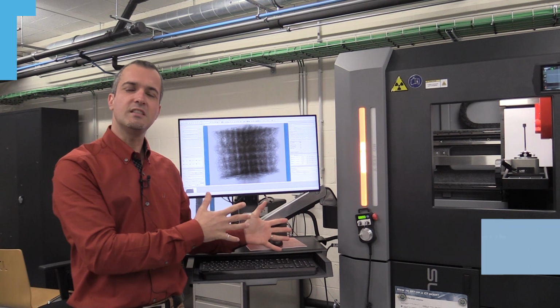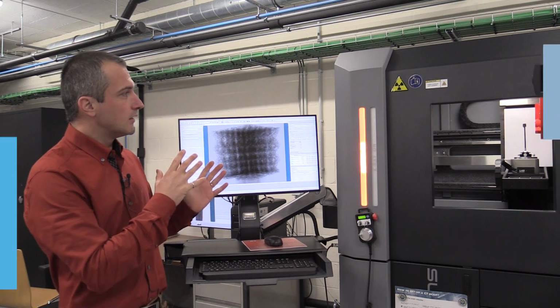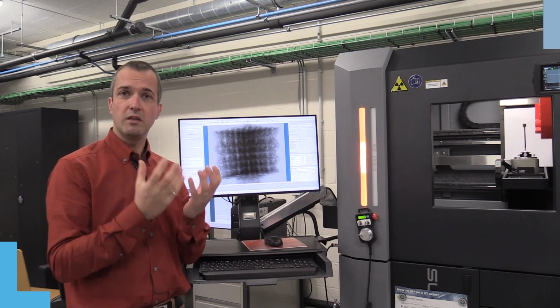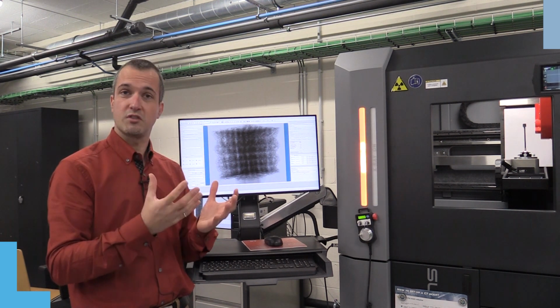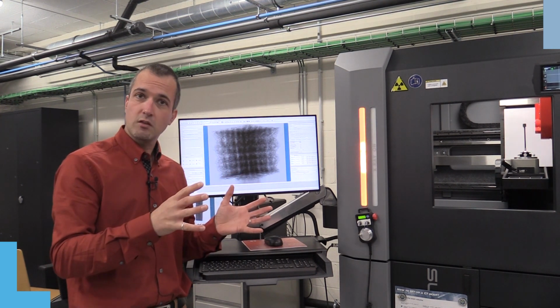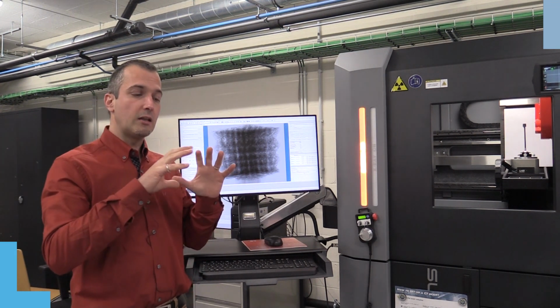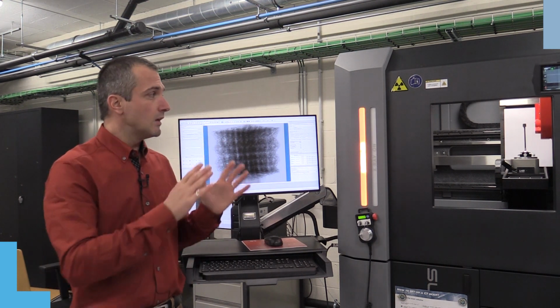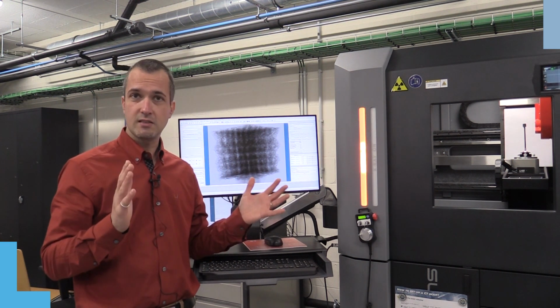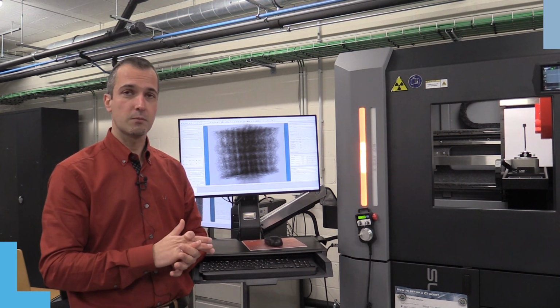We have here a CT scan or a 3D tomograph using X-ray radiations. This tool is typically used to retrieve the shape and the 3D geometry of a sample, to characterize the vacancies, for example, the roughness of the structure, the 3D shape, the different composition inside a material, and reconstruct the volume in 3D. Typically with that instrument we can reach a resolution of a few microns, which is the smallest, up to 10 centimeters, and reconstruct the volume of those different samples.